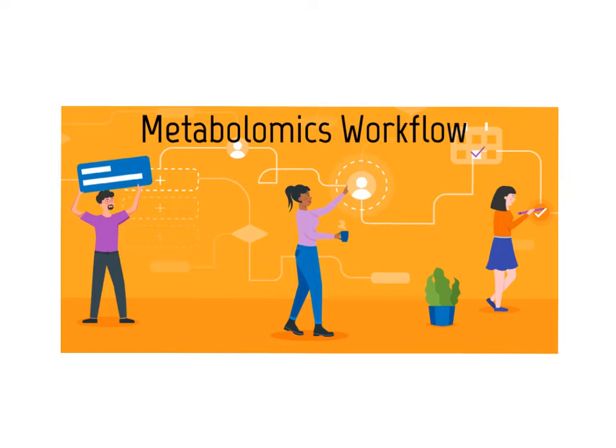So we're going to walk through the full process of this, beginning with the collection of samples and extraction of those samples through the analysis of compounds within those samples by LCMS, GCMS, NMR, and other techniques. And then we will give an overview of the ways that those really complex data sets are analyzed and interpreted. So let's go ahead and take a look at this metabolomics workflow from the beginning.